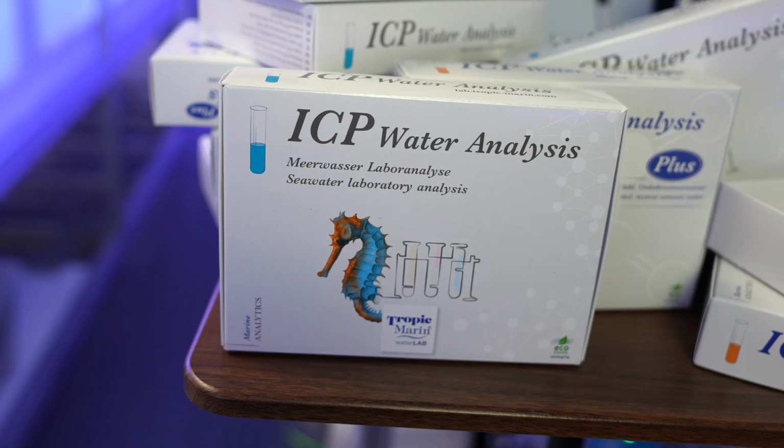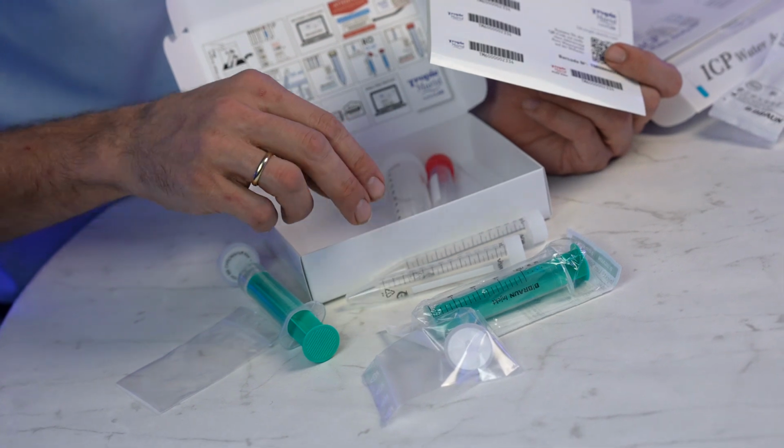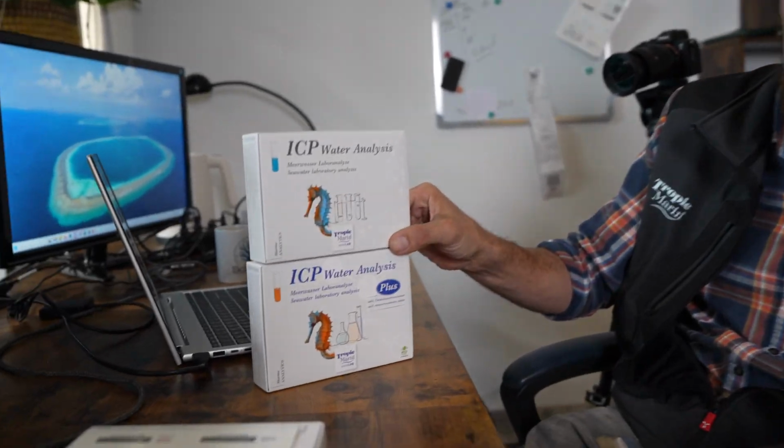There is already a video online that describes the process, how you take the sample, etc., and what the ICP actually does. And now we want to look into what happens when you prepare your sample and you need to get the data somehow and how all that works. There's two versions. It's also described in the other video.